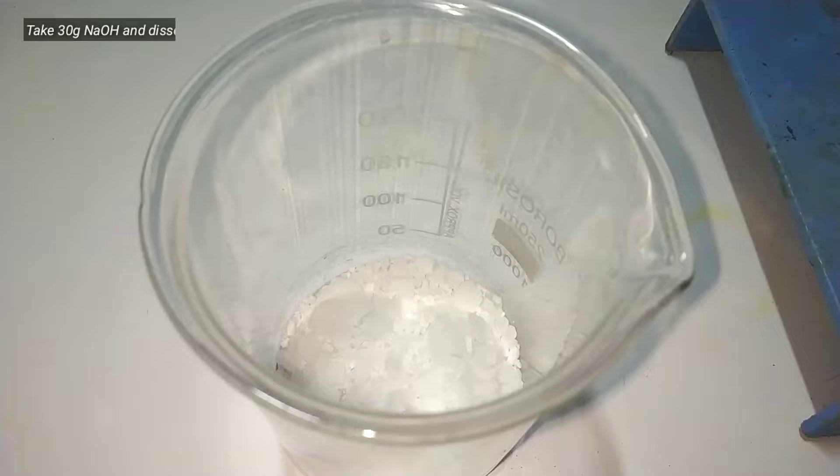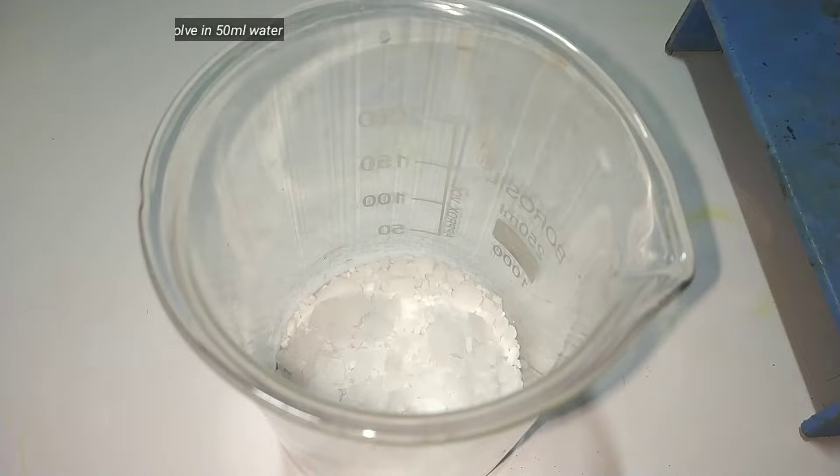While it is being refluxed, we prepare a sodium hydroxide solution by dissolving 30 grams of sodium hydroxide in 50 ml distilled water.